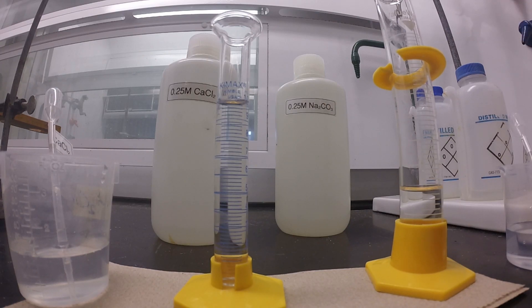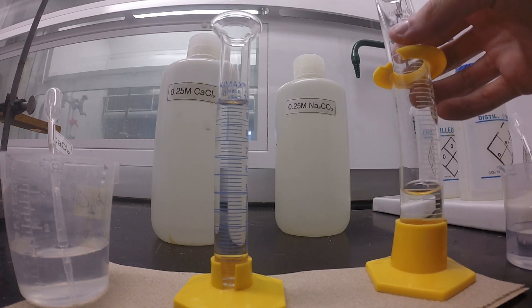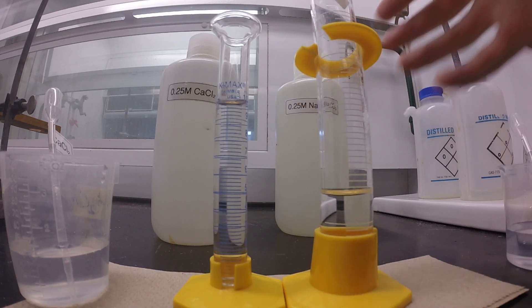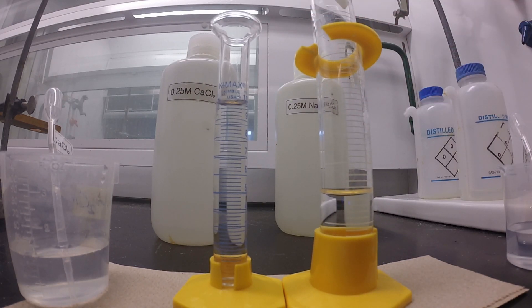So now we have both of our reactants ready: the 10 mL of the calcium chloride and the 15 mL of the sodium carbonate. Now that those two are measured out, we're going to go take care of the filter paper.